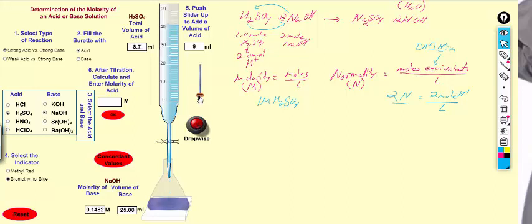Still nothing happening. I'll try to go up another. Try to go down. Oops, see, now I overshot it. Okay, so clearly 10 milliliters is too much, but that's the first one you can do, right? So in your report sheet, you'll write this down: 10.22 milliliters of acid.